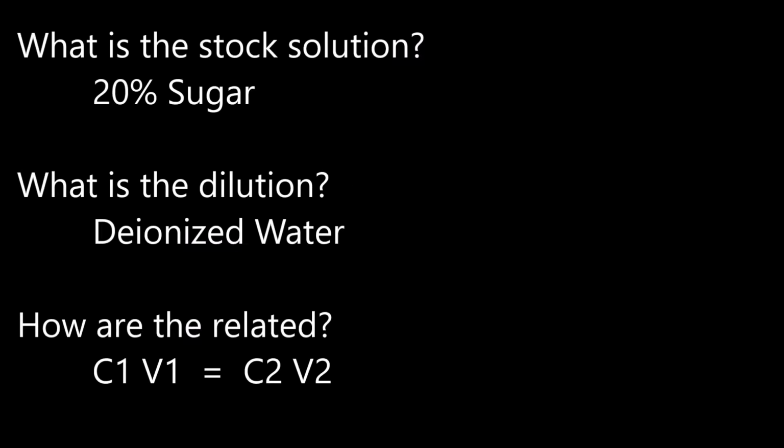It is important to understand the three questions displayed on screen. First, what is a stock solution? A stock solution is a concentrated solution that will be diluted to some lower concentration for actual use. In this lab, it is a 20% sugar solution.